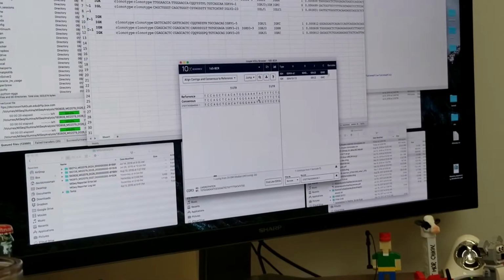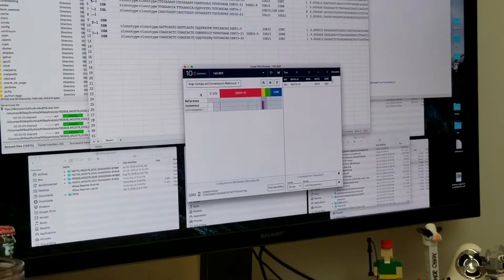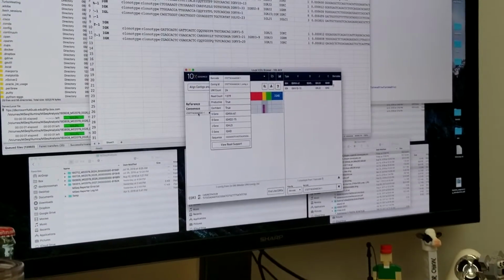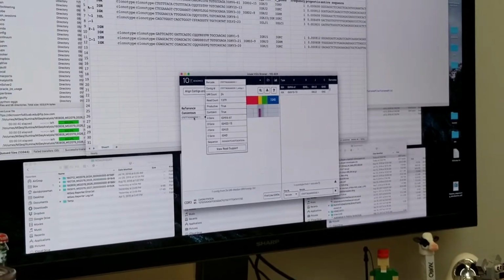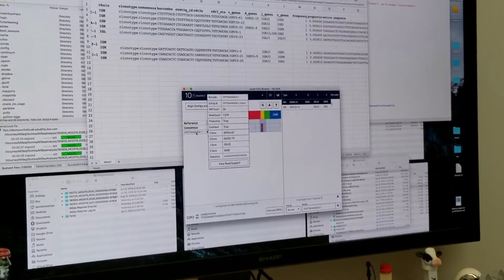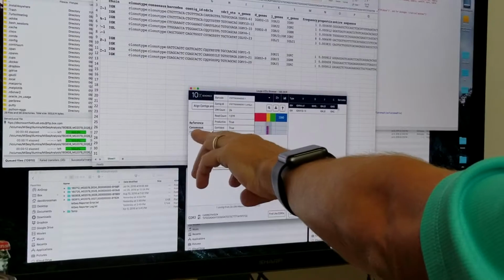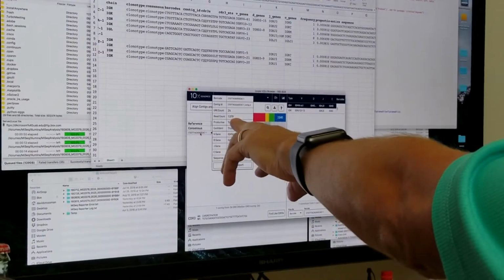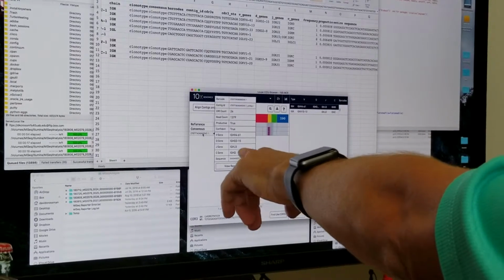How many base pairs is that? That's a good question. Because actually, we have to make this thing, and we don't have the amino acid, we don't have the nucleotide, we don't have the clone. I think that would be right there on the front, but I don't see it. I see that there were 24 UMI counts of that particular barcode, and almost 1,400 reads that aligned across that.